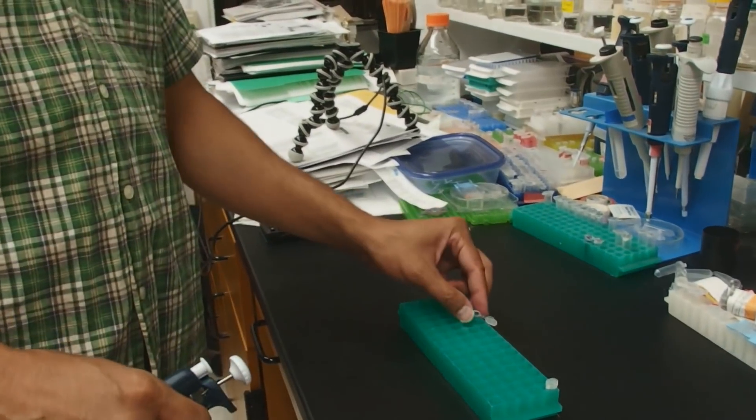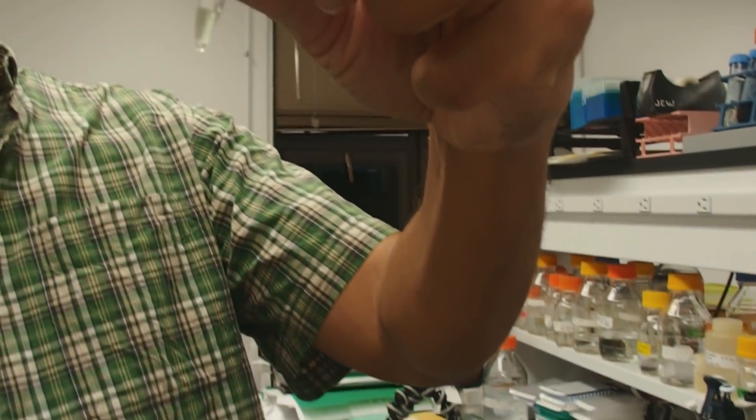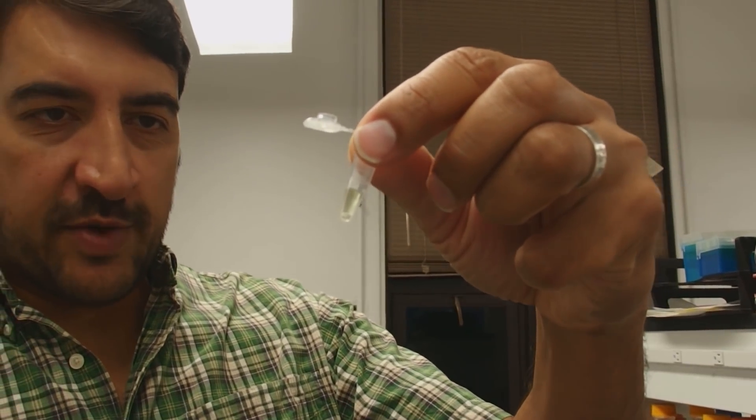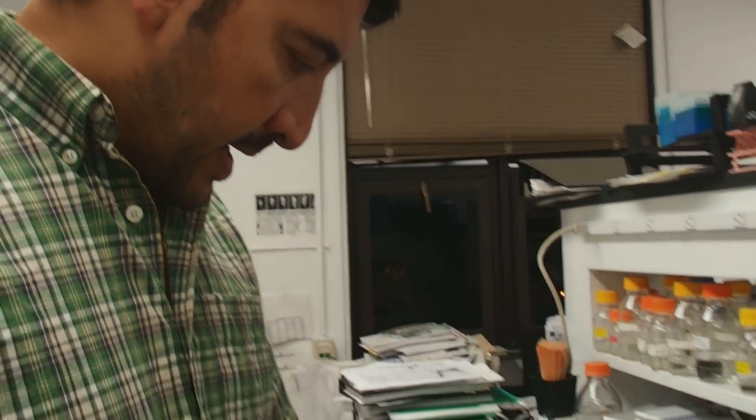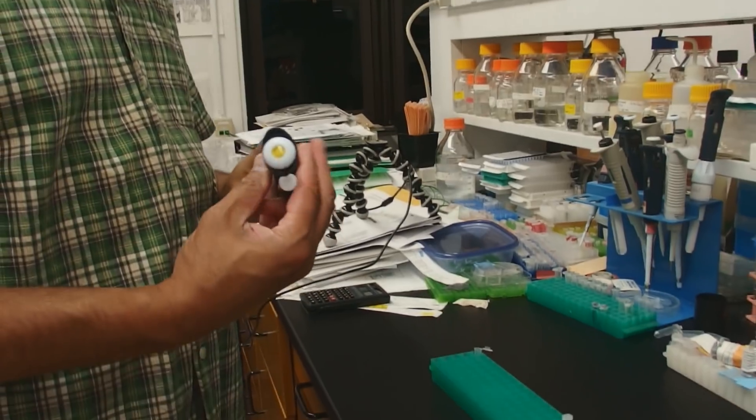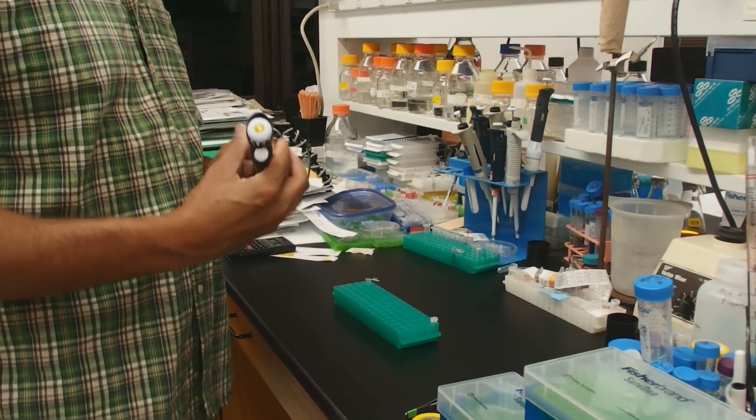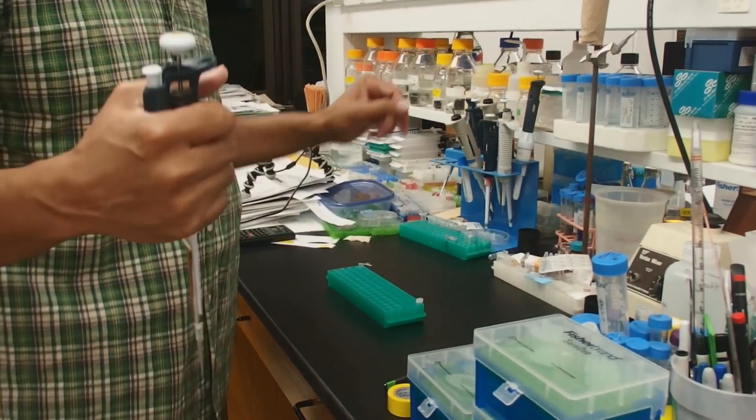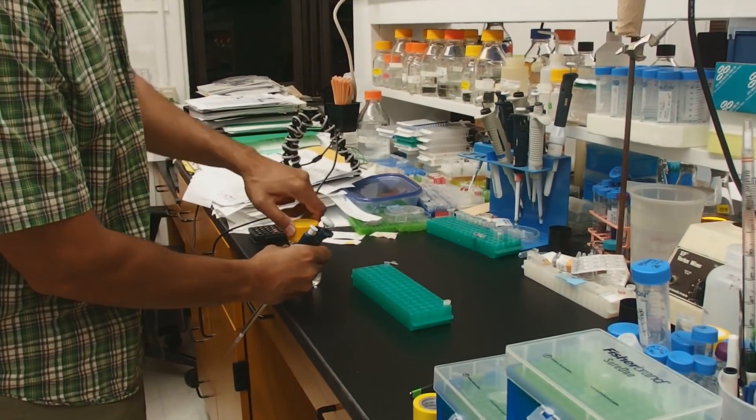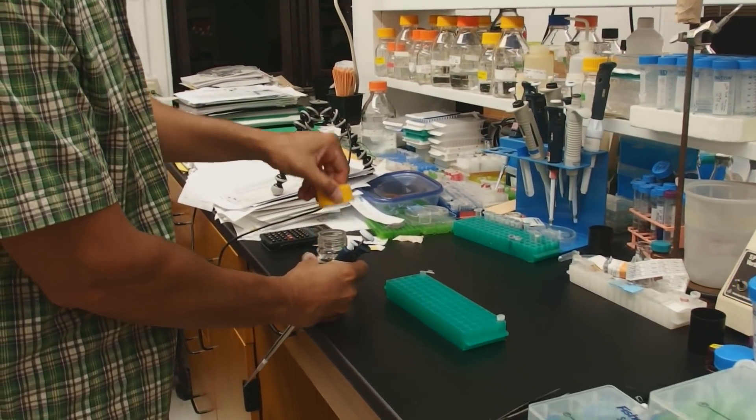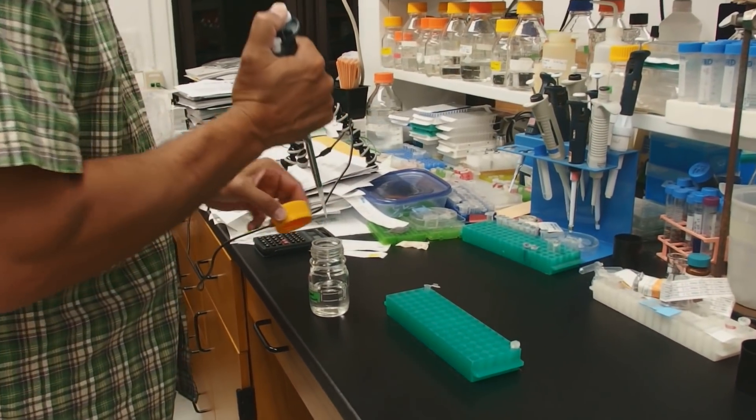Can you show the tube? So we have a pretty clear liquid. It does have a little bit of greenish color here. Now we're going to add isopropanol to it.